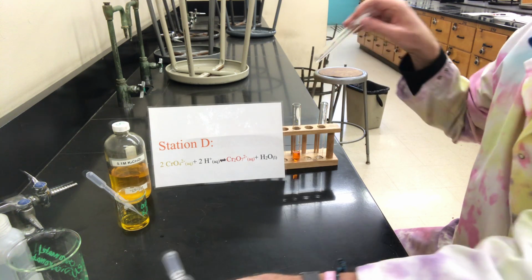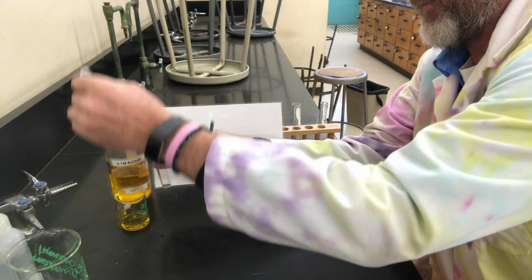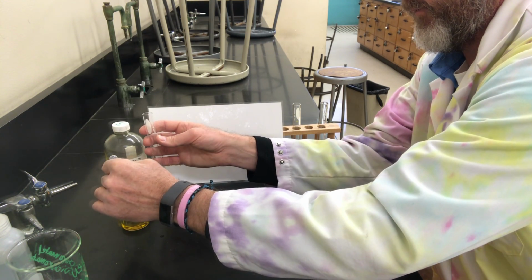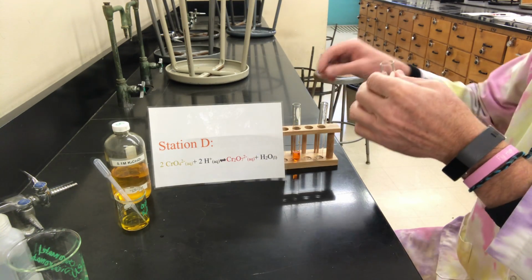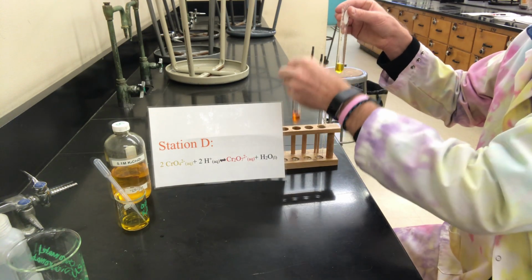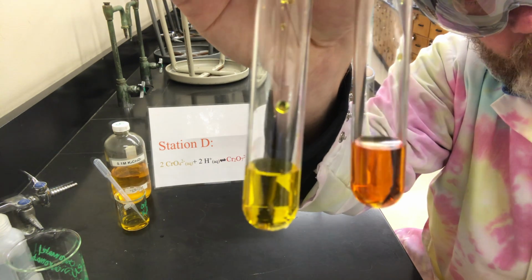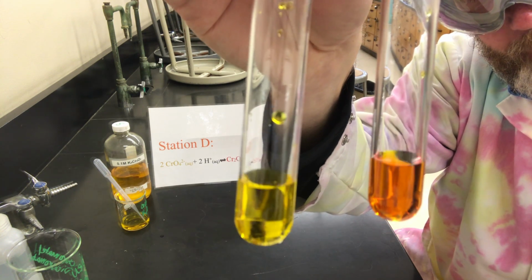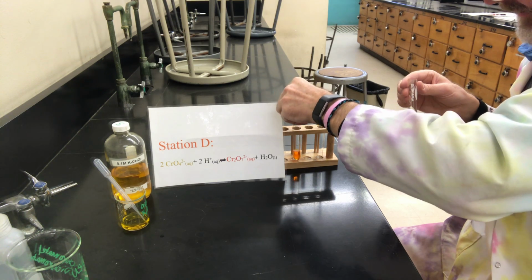Let's start off with a fresh batch of dichromate. Okay, so again, for comparison, here's our dichromate, and this is after we added the nitric acid. Okay. So let's put that test tube 1 back in its place.